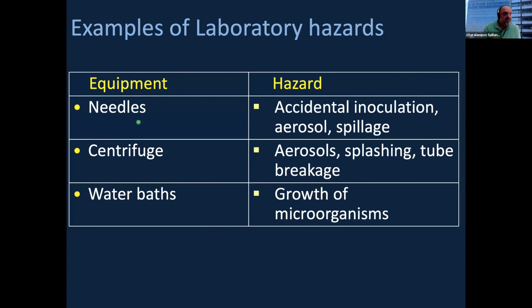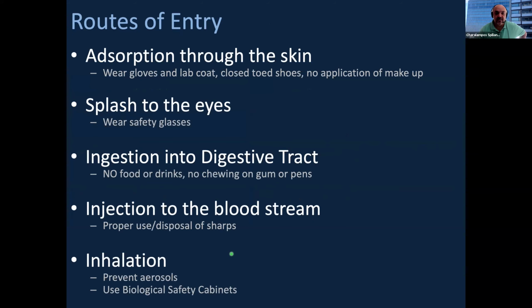I remember myself injecting ethidium bromide in my bloodstream. Not a huge quantity, but it could potentially be dangerous. So this equipment, the needles, the centrifuges, and the water baths, whenever we need it, we use it. And we work with the biohazardous reagent. We have to really be quite careful, actually, not to create an accident.